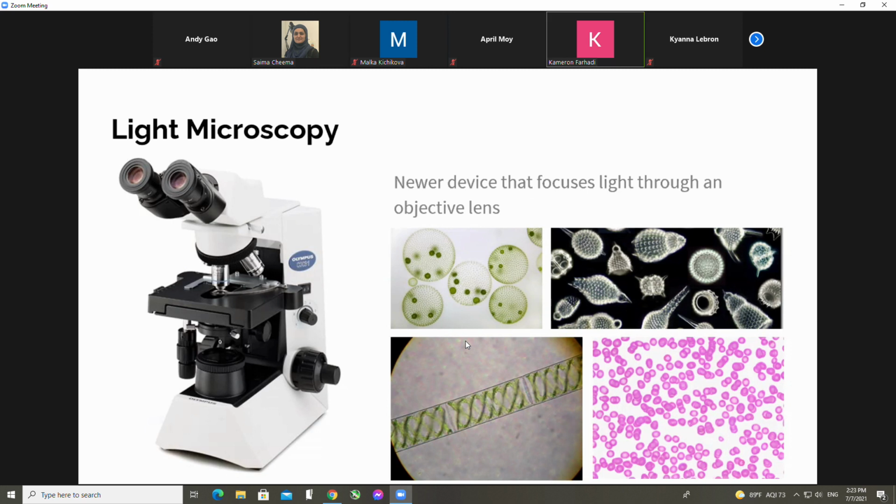In general terms, it's the ability to distinguish fine details, right? So how clearly you can see an image. For example, with this particular one, which looks like a diatom or some algal structure, you could see little beads on its surface. That's a very fine resolution. You can really see the details well. If it's an actual image, it was taken with a microscope that has a very high power of resolution, and generally electron microscopes would give you a very high resolution like that.